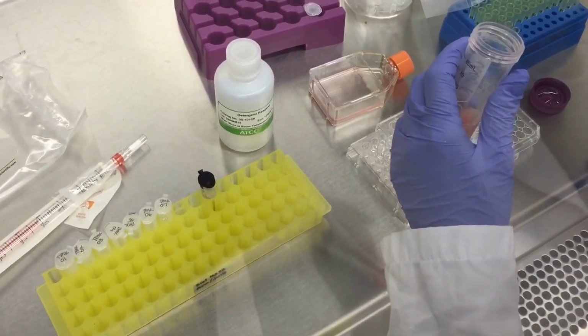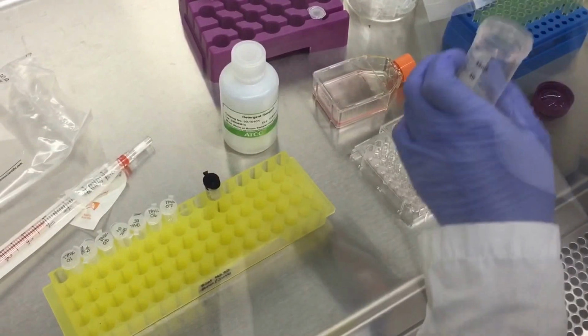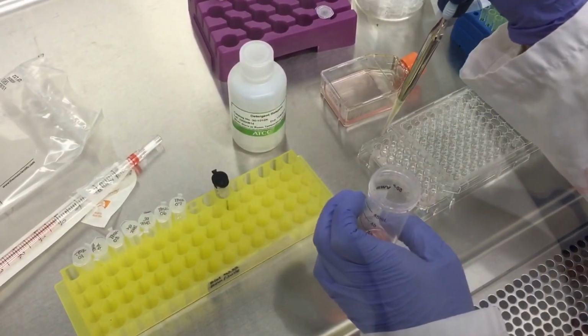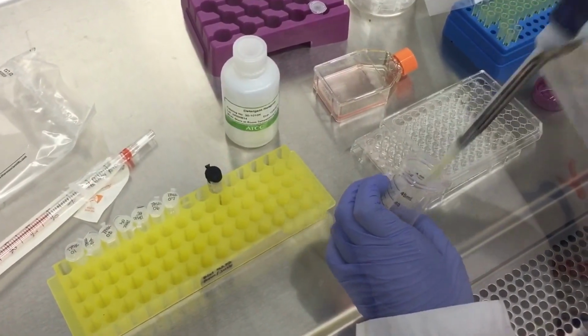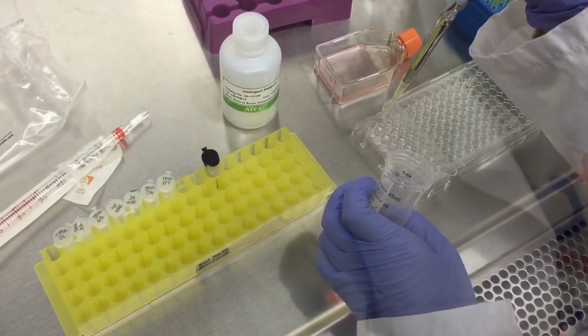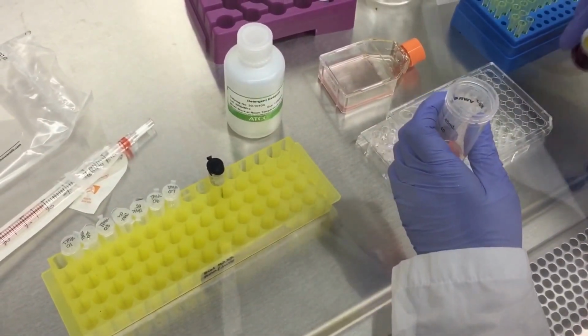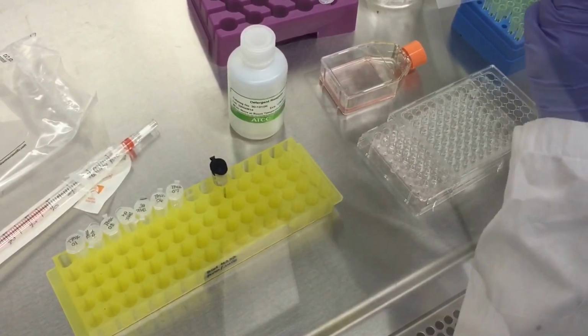So we're going to put in 50 microliters of media into the first 2 columns. Okay, now for the rest of the wells, we will do 40 microliters of media.